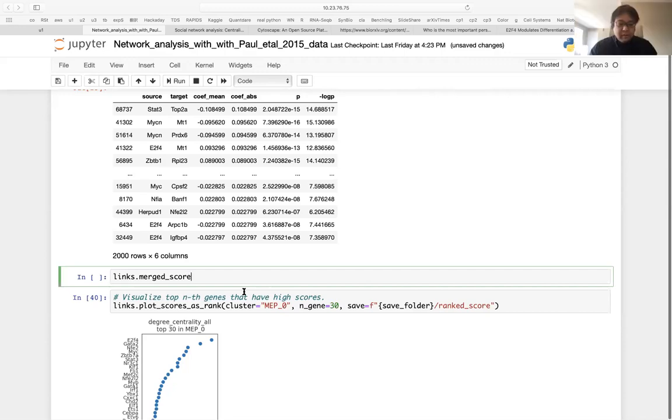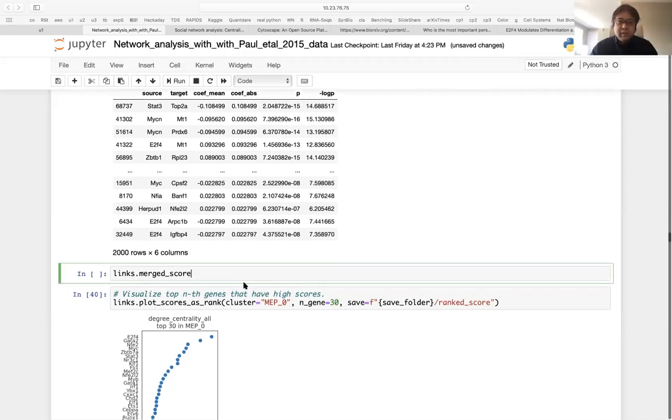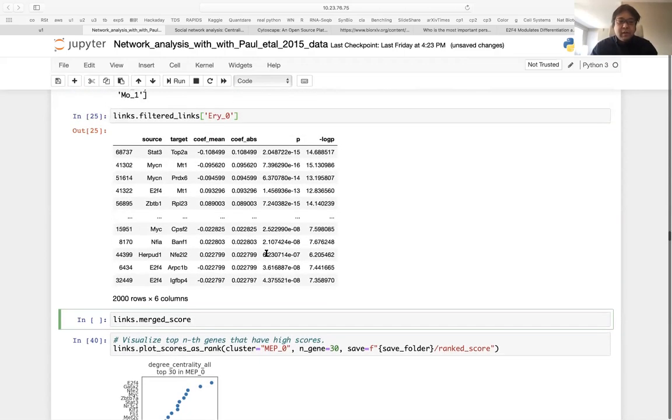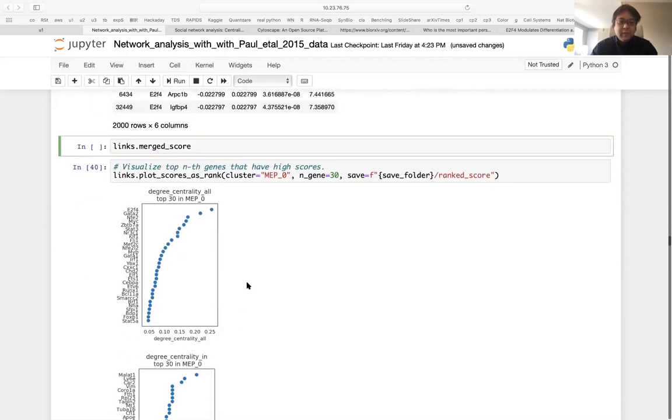So in general, there are some methods to measure the similarity between networks, but in CellOracle we do not have any function to calculate the similarity. We have some functions to analyze the GRN, but they are for analyzing the gene function or the gene module or something.